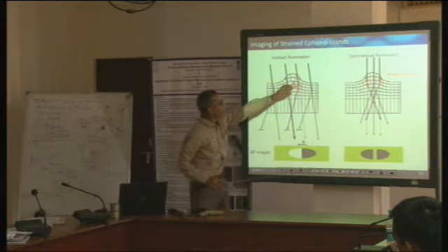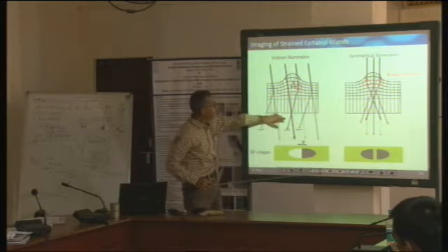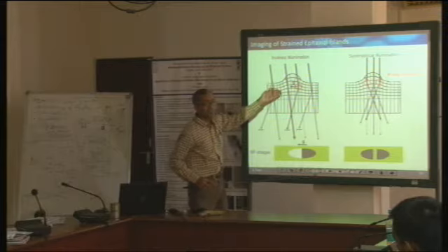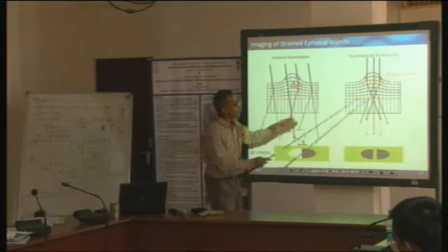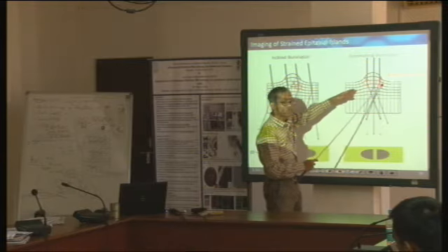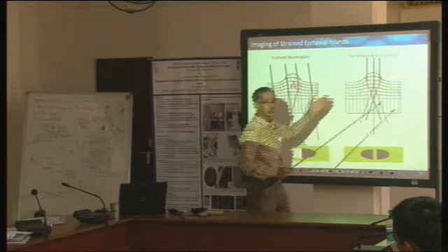Then this particular part will scatter the intensity, and therefore it will look bright. No other part is able to satisfy the Bragg diffraction condition. Whereas if it is symmetrical like this, then this part also satisfies the Bragg diffraction condition, and because of symmetry the other one also has to.